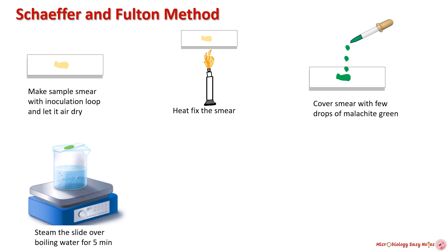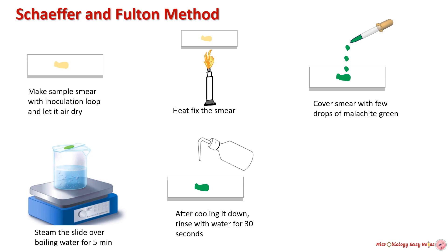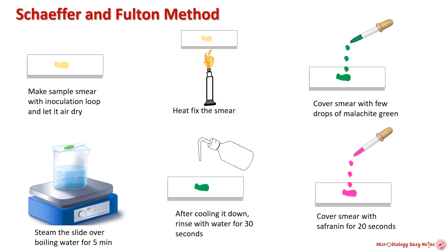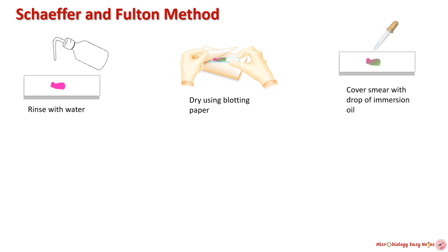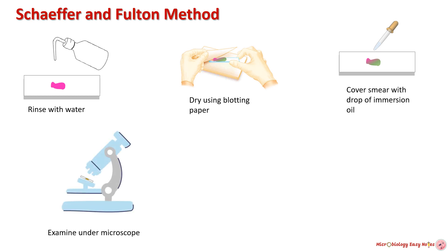After heating with malachite green, the slide is rinsed with water for 30 seconds to remove excess stain. Safranin is applied to the slide to stain any remaining vegetative cells. The slide is again washed with water to remove excess stain, then gently blot-dried using blotting paper. The smear is covered with one drop of immersion oil and examined under the microscope.